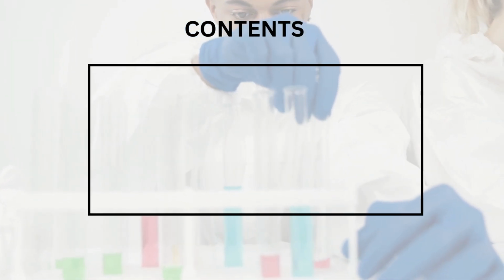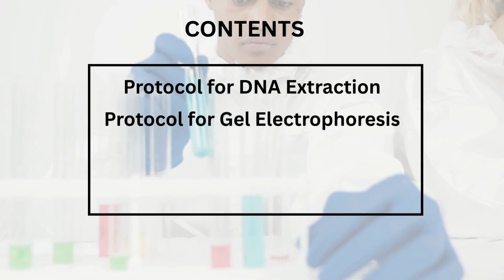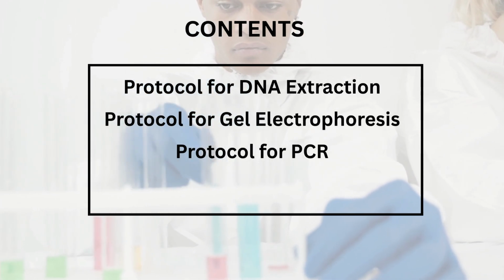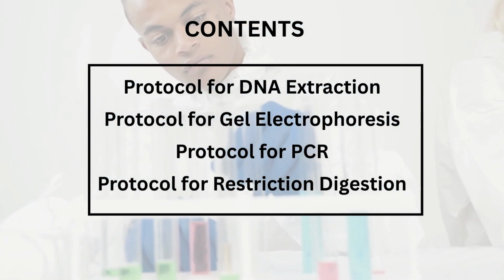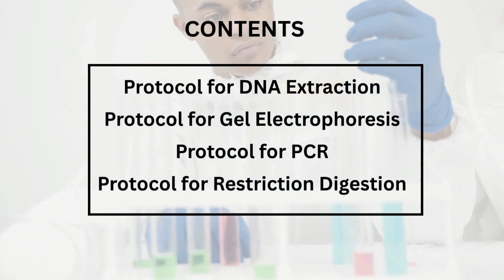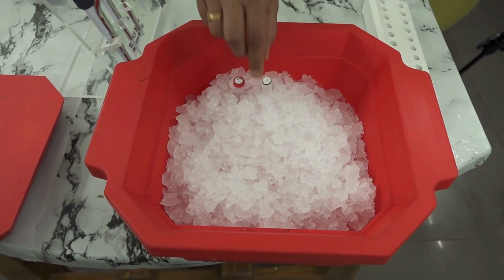Contents of the manual: DNA extraction, protocol for gel electrophoresis, protocol for PCR, protocol for restriction enzyme digestion. DNA extraction.